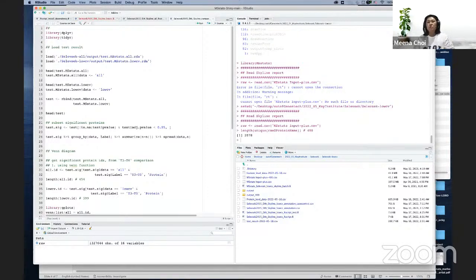However, for example in the IP case, this assumption is not suitable anymore, so we should not use these normalizations. Multiple step normalization is also very good. We can do many processing steps, but so many processing steps can also ruin the data set, so we have to be careful. For me, this normalization step is just to remove the systematic error, and we want to keep the other variance as much as possible. My question is whether the protein level distribution should be equal. The more the feature level is original, the more variance and intensities are there, and I think that is more suitable. For the protein level I still have a question mark. It's hard to strike a balance, but I try to keep the feature level and not perform protein level normalizations.